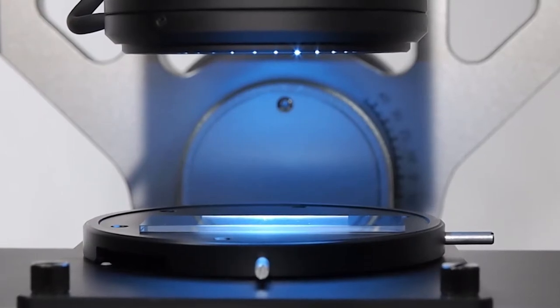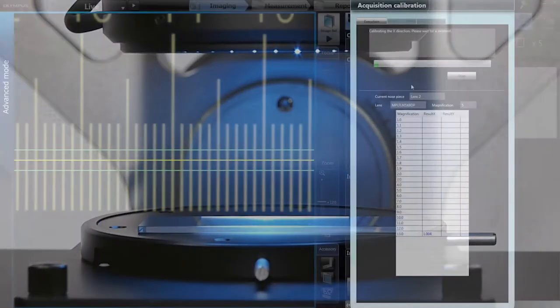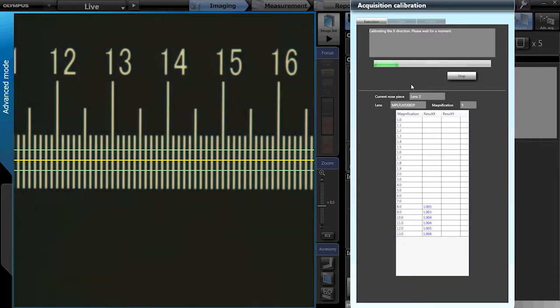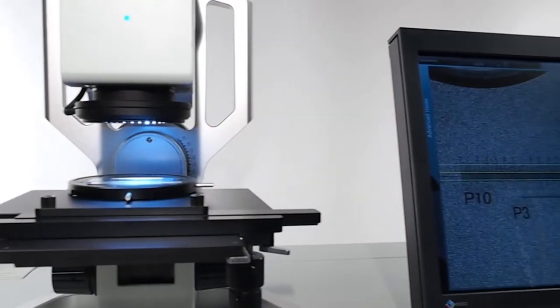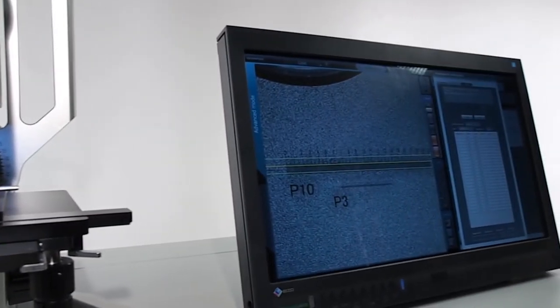With DSX digital microscopes, auto calibration verifies the reliability of your measurements and analysis to ensure consistent results every time.